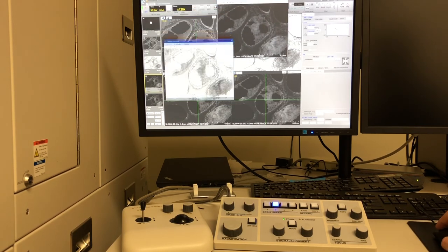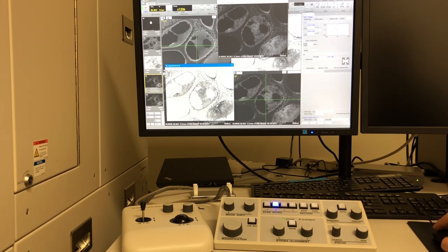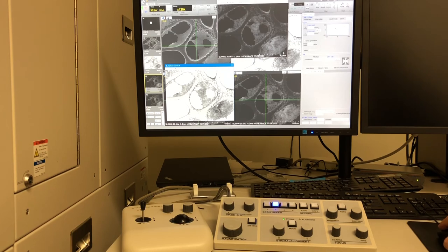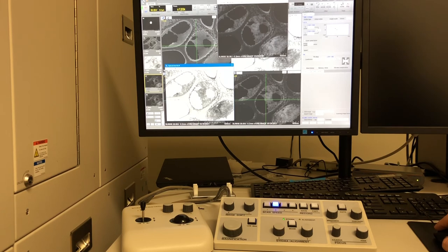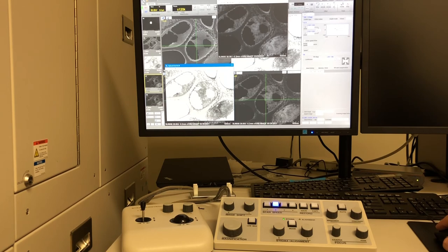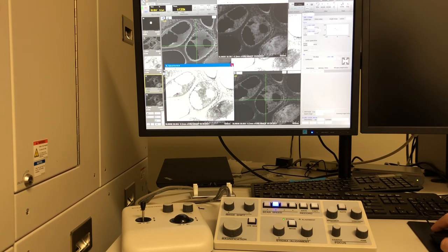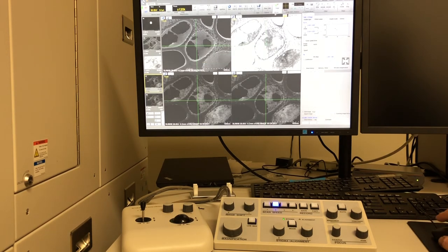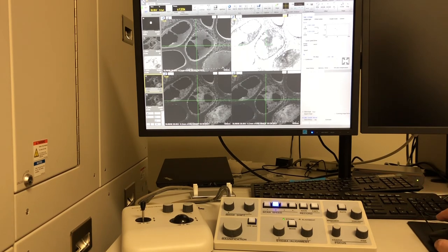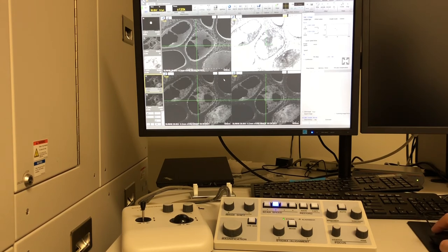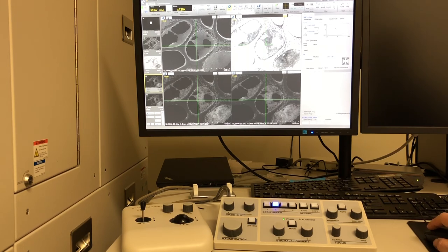So now you can see the kind of images that are now saved. It should be noted that the entire scale bar region is going to be 400 nanometers in this case, with the area between each of the hash marks being 40 nanometers and each hash mark in particular being 4 nanometers. So we can use that to kind of qualitatively gauge the size of our particles while we're live imaging, and then when we get back to do the real measurements, get our quantitative basis and histogram measurement for all of our small particles. Then we'll press run because we'll want to make some more images, and that brings our images back to being live.